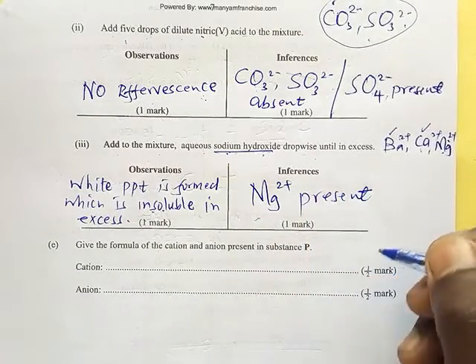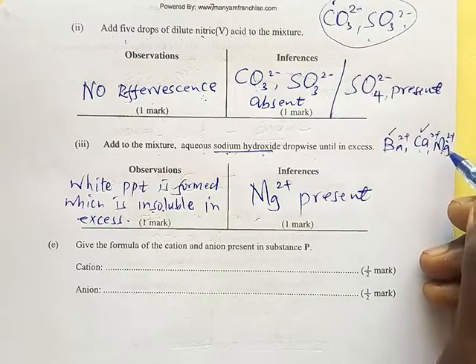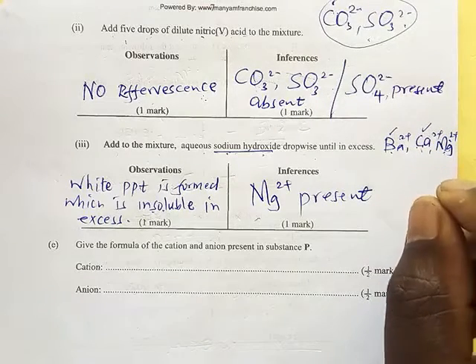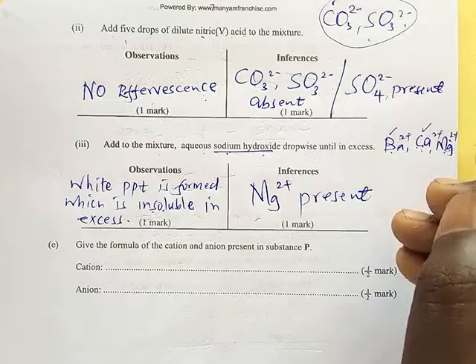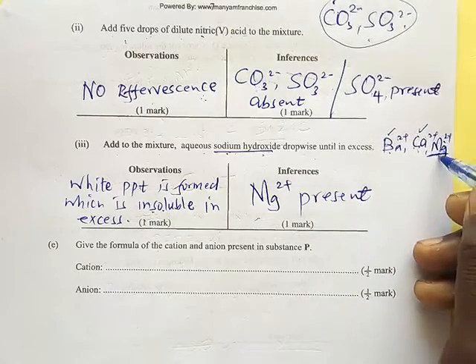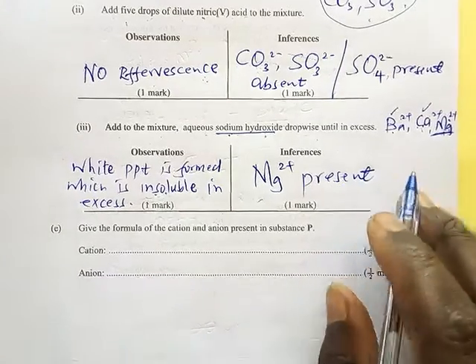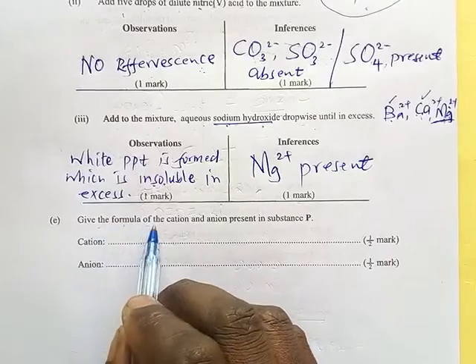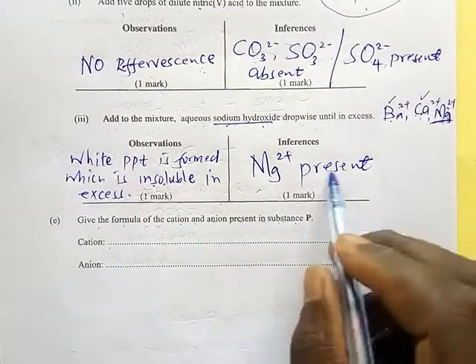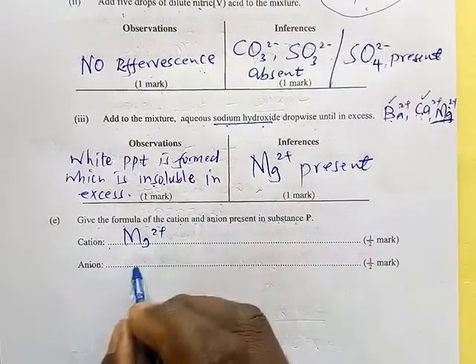Why do we ignore that? This one forms a white precipitate, which is very white. But when you look at the others, they form a white precipitate, but it is not that white. But this one forms a very white precipitate, so we just take it as the one that is present. So give the formula of the cation and anion present in the substance. So the cation is magnesium and the anion is the sulfate.